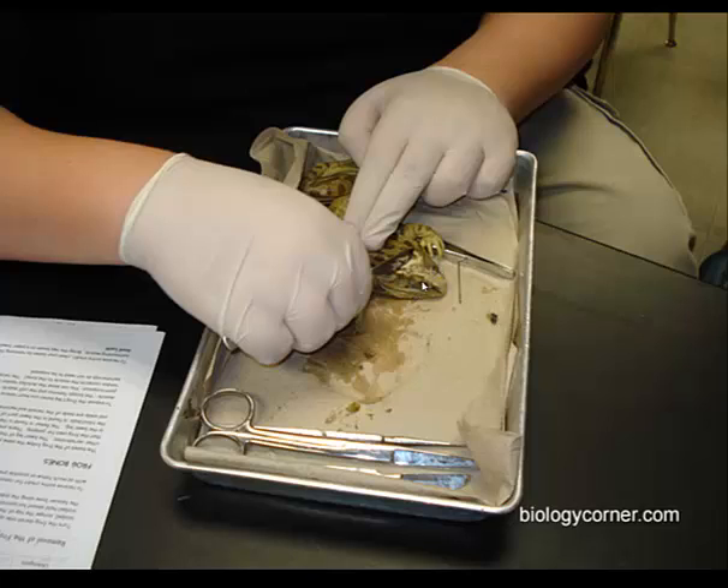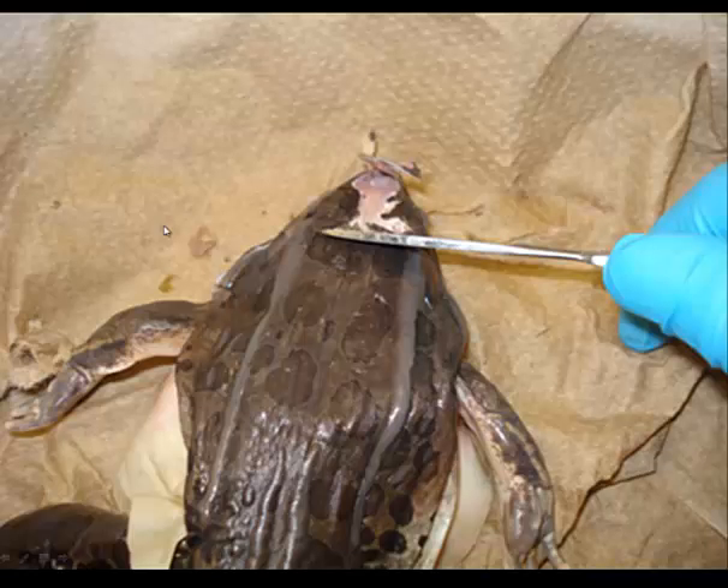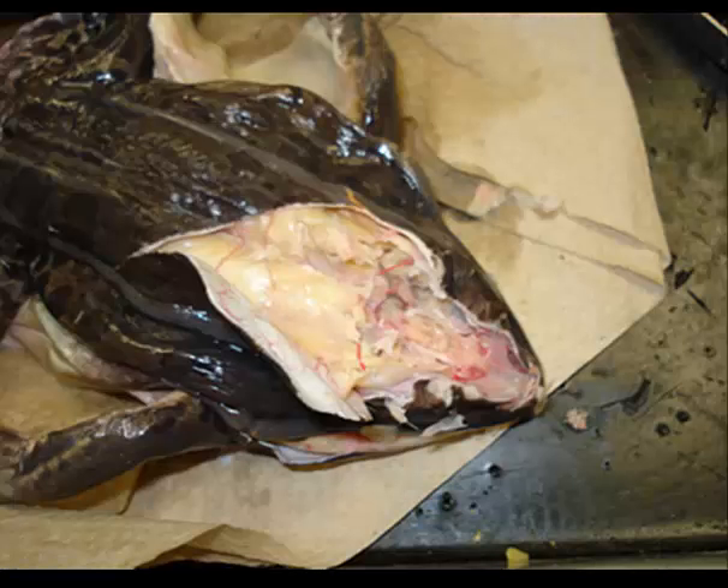To dissect the nervous system, start scraping the skull of the frog in the top cranial region — here's where the eyes are, and the tympanum is down below. Start scraping through, and you'll have to cut through some bone. You'll start to see the brain beginning from the external nares, traveling back through the eyes, back to where the tympanum is.